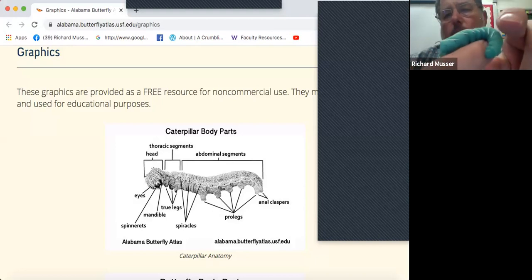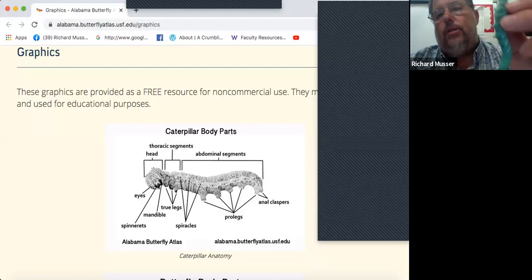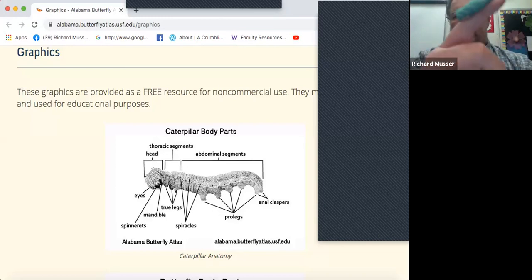As I mentioned, the true legs are found on the thorax up here near the head. But these down here are actually pro legs holding on pretty good. They're just protrusions of the abdomen. This is the abdomen region all the way down to the end, and this is called an anal clasper that allows them to grab on the leaves.